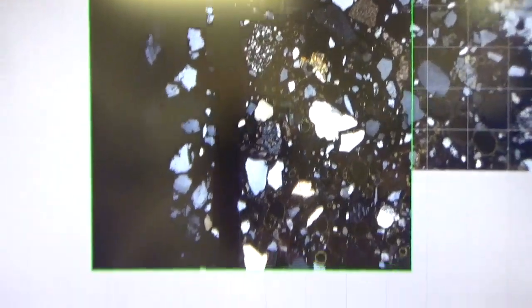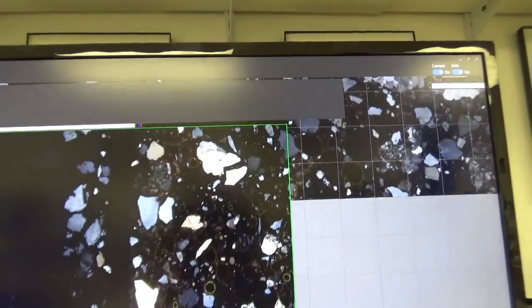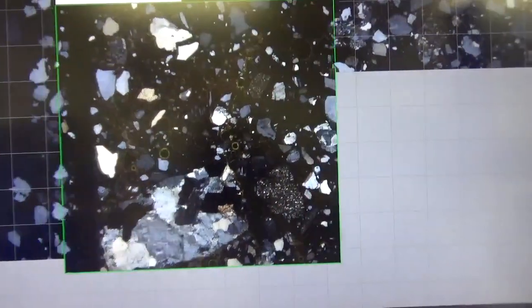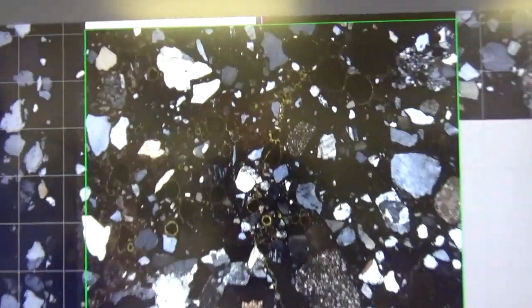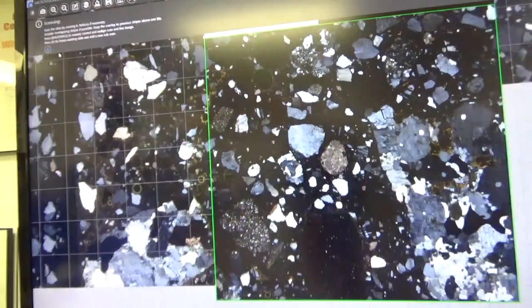The distribution of these particles is especially important for the whole slide scanning with this software. You can see the quartz sand in the urethane coating. Make sure you keep 20% overlap. And the carbonated Portland cement paste, the golden yellow birefringence of the paste, can be clearly seen when you do the cross-polar scan.